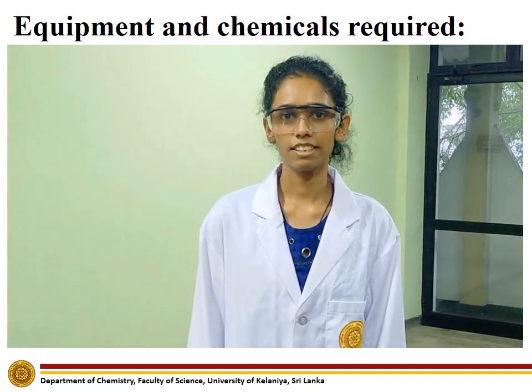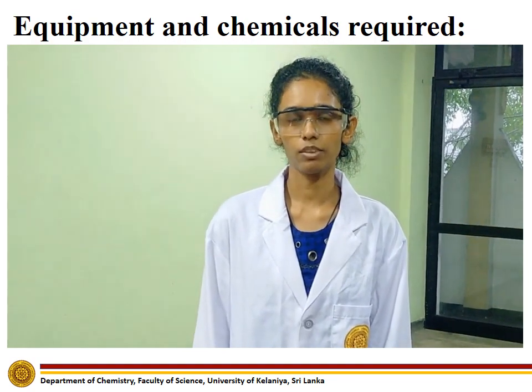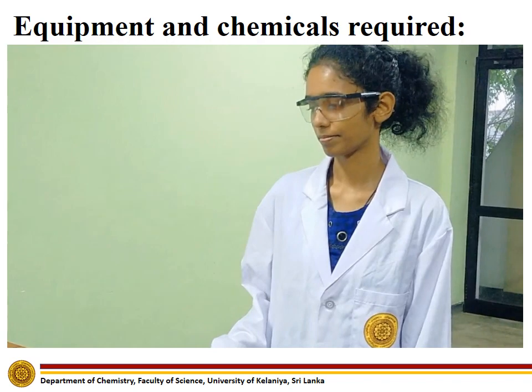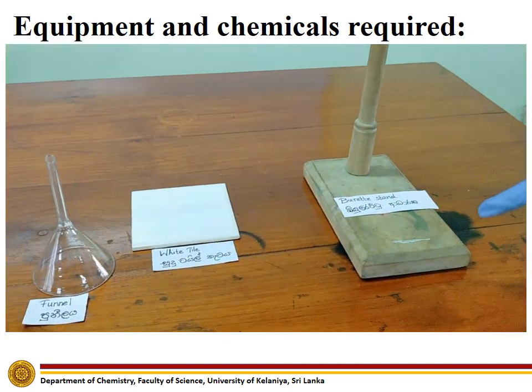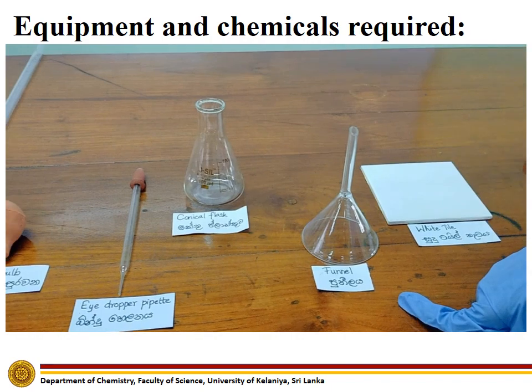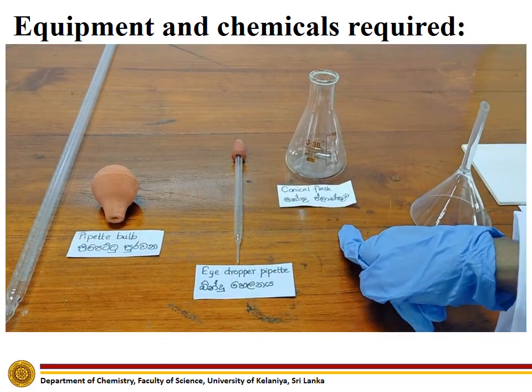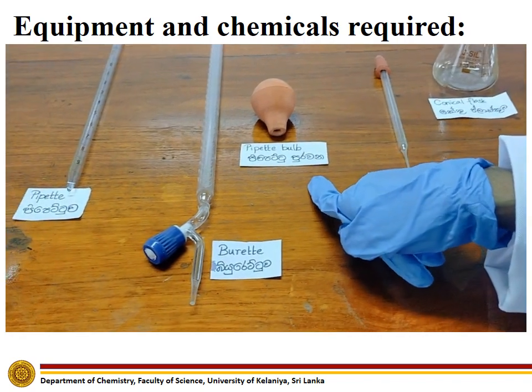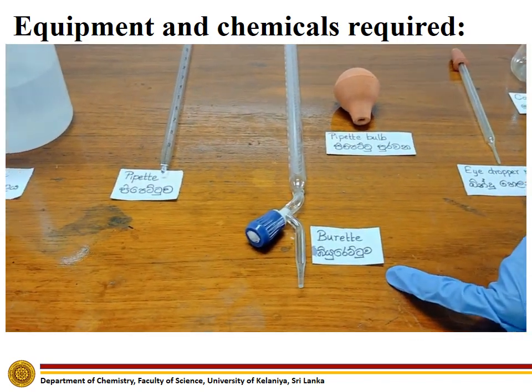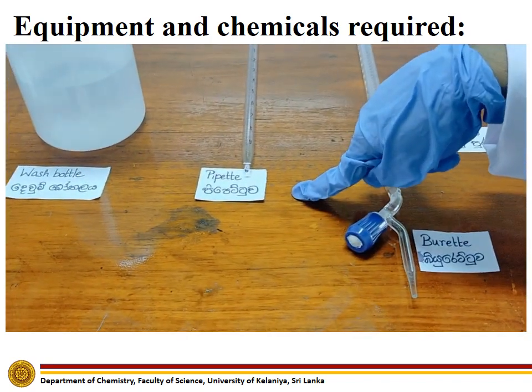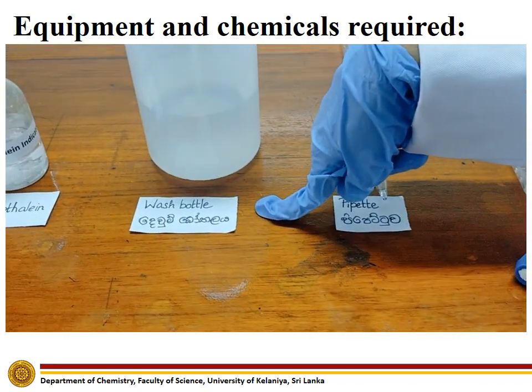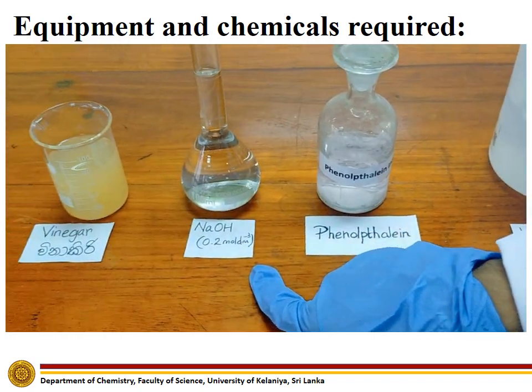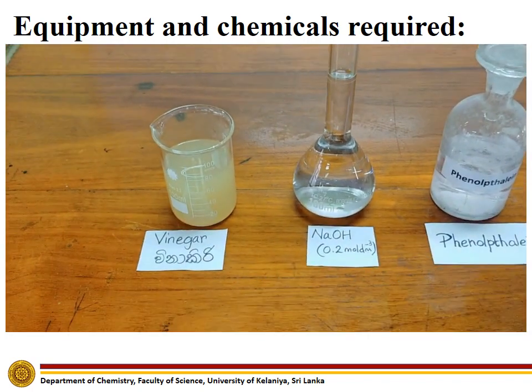The chemicals and equipment required to carry out this experiment are: burette stand, white tile, funnel, conical flask, eyedropper pipette, pipette bulb, burette, pipette, wash bottle with distilled water, phenolphthalein indicator, sodium hydroxide solution, and vinegar.